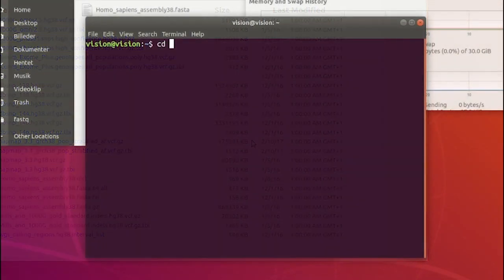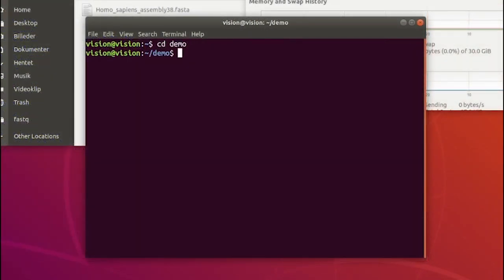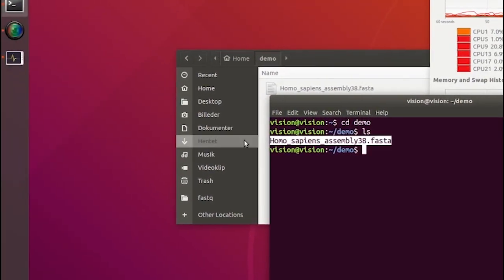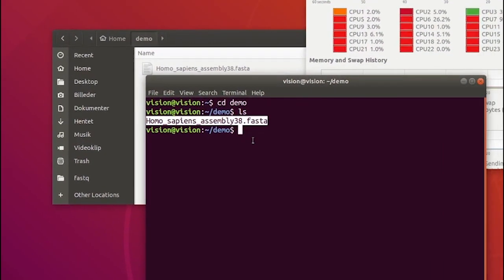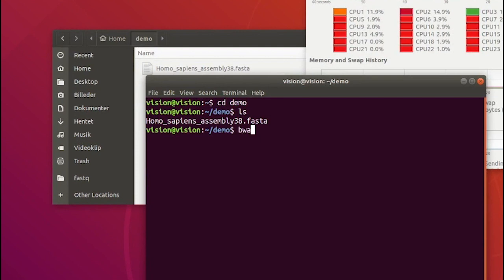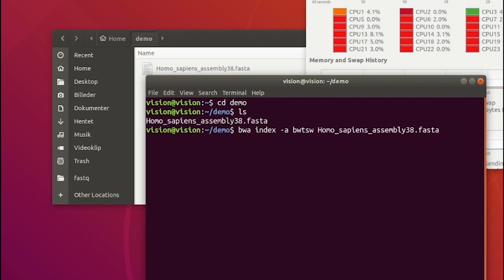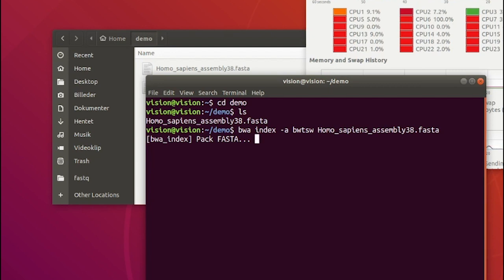Now, before you are able to do actual alignment of your sequencing data, the Burrus-Wheeler alignment tool must construct an index of the provided genome. Fortunately, this is a very simple task using the BWA index command. Please note that even if you have many cores on your workstation or server, the tool will only use one core, so the indexing may take some time.